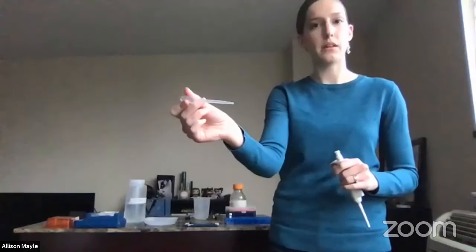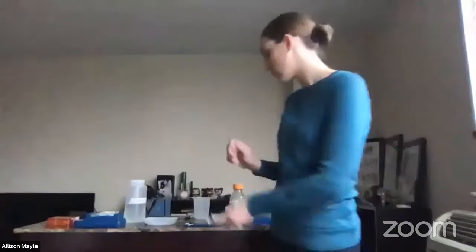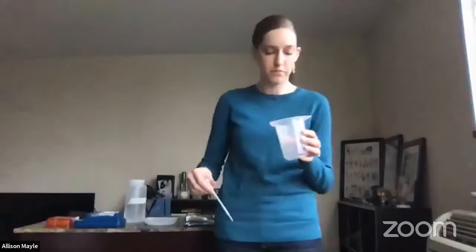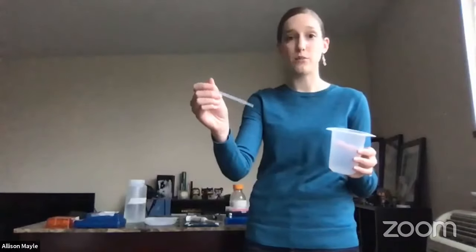So a lot of times I start my class by asking the students, if I wanted to use this dropper to transfer some liquid, imagine I had some liquid in this beaker, right now it's just air, and I wanted to transfer some liquid from this beaker onto the floor. I don't know why, but just for fun. What would I do first? Because this works exactly the same way as the micropipette, but the micropipette is more precise.